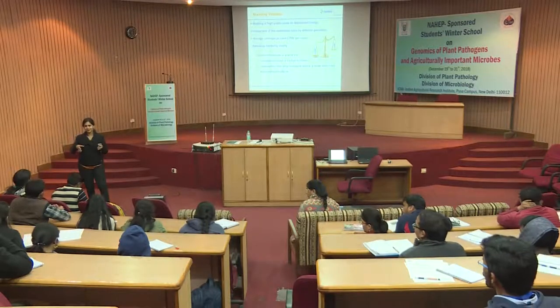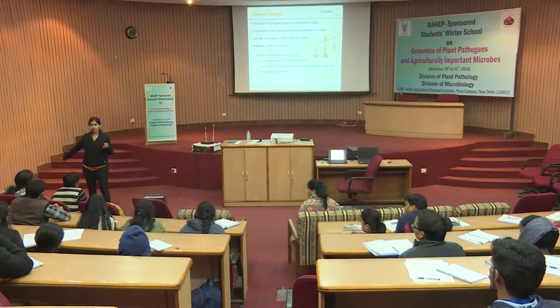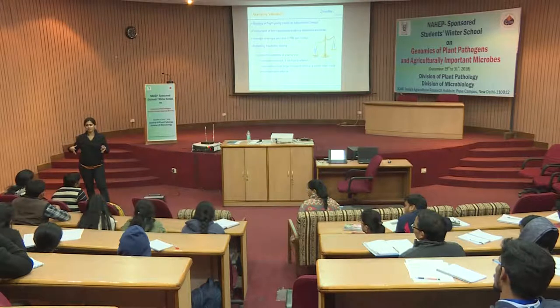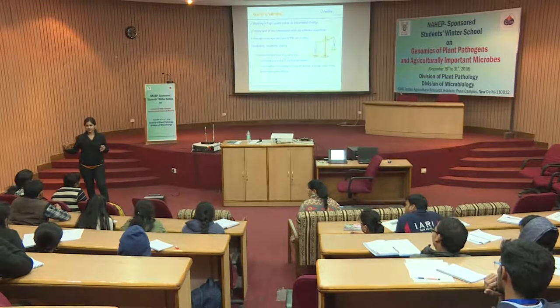That is a theoretical explanation. But the reads were not going beyond 2 kb, whereas they should reach up to 15 kb. So, my average read length was coming 1 kb or 2 kb max. That means the polymerase is just clipping off and the reads are getting chopped off. So, there is a chance that it is introducing something else, SNPs or indels. Usually what we see in PacBio is that they introduce indels. Right.